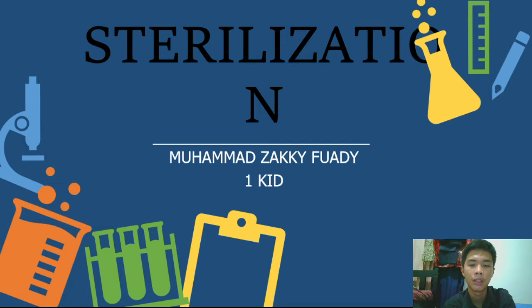I will start with the definition of sterilization, then what materials and tools we need to sterilize, and also the methods to sterilize laboratory glassware. As you can see in the handout, there are three main points I will talk about. So let's start from the first page of my presentation.